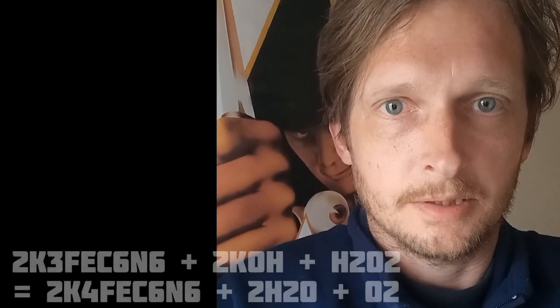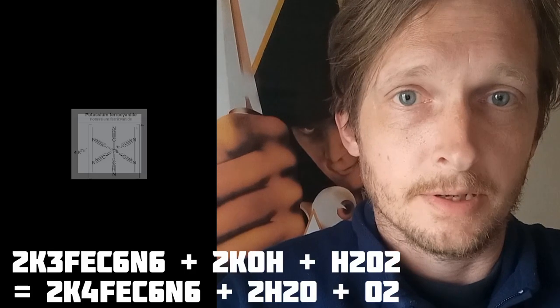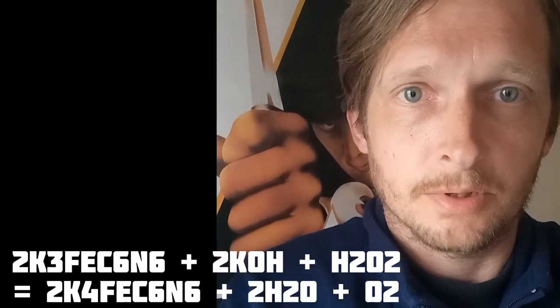Today we are going to reduce potassium ferricyanide to ferrocyanide using potassium hydroxide and hydrogen peroxide.